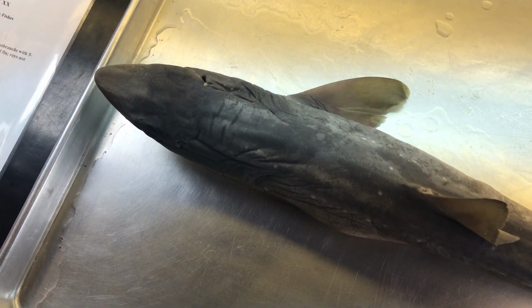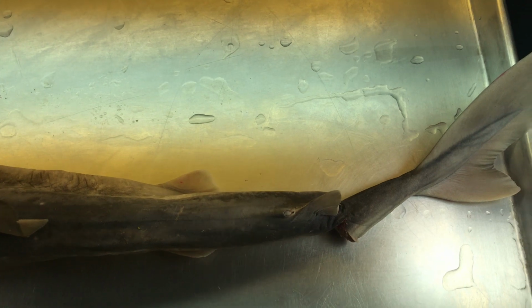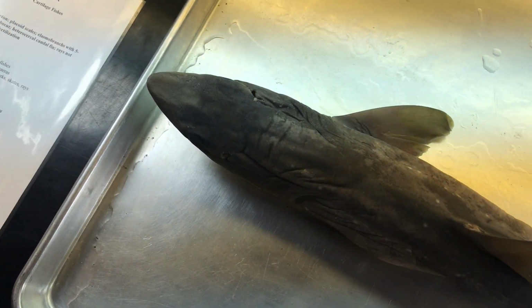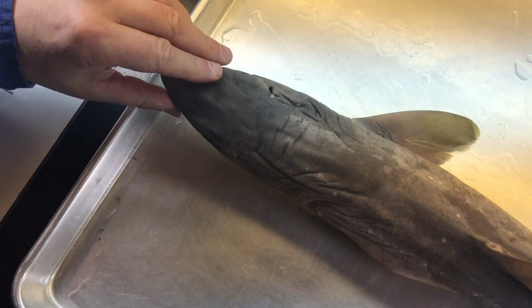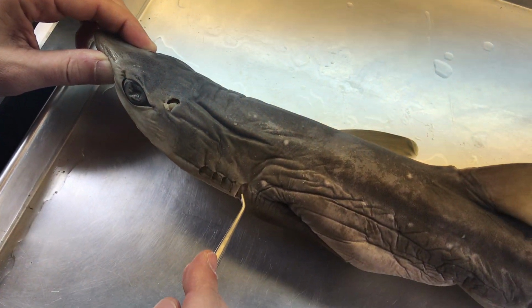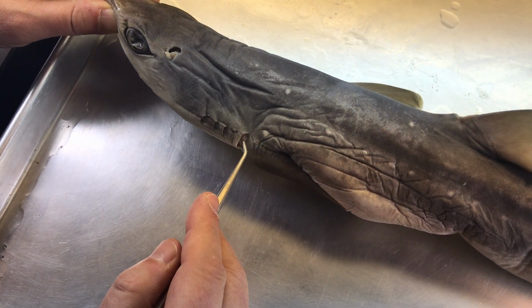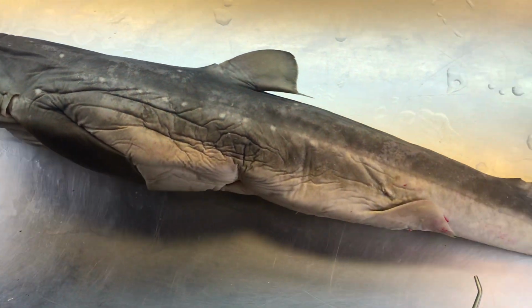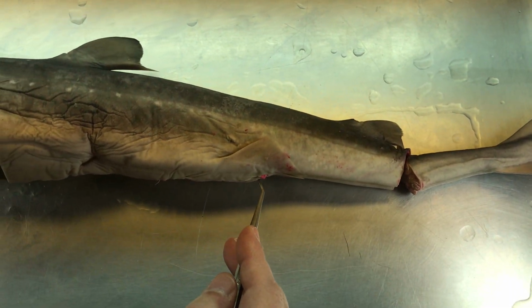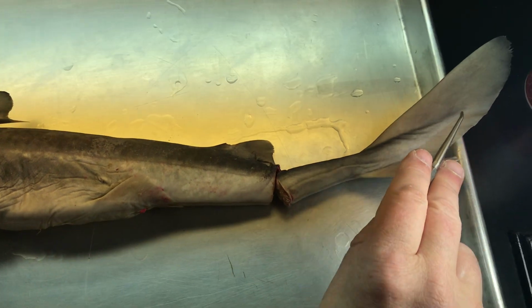Okay, this video will be on the external anatomy of the dogfish shark. The body can be divided into three regions. We have a head, which goes from the tip of the snout, basically to the last gill slit. The trunk goes from the last gill slit all the way down to the cloacal opening. And the tail goes from the cloacal opening, rest of the tail.